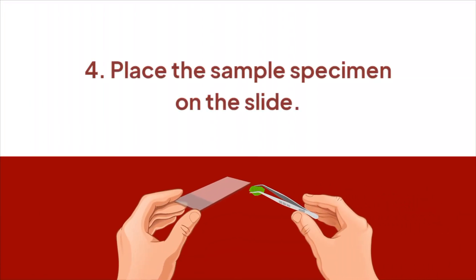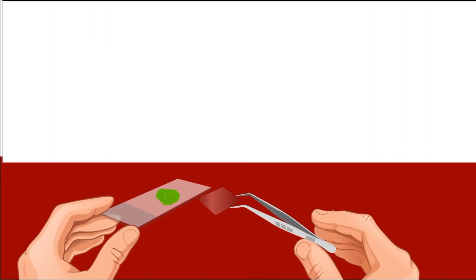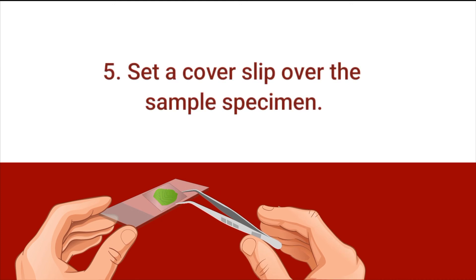Place the sample specimen on the slide. Use forceps to pick up the thin slice of your sample specimen. Do not pick the sample with bare hands. Set a cover slip over the sample specimen — it prevents the sample specimen from tumbling off the slide.